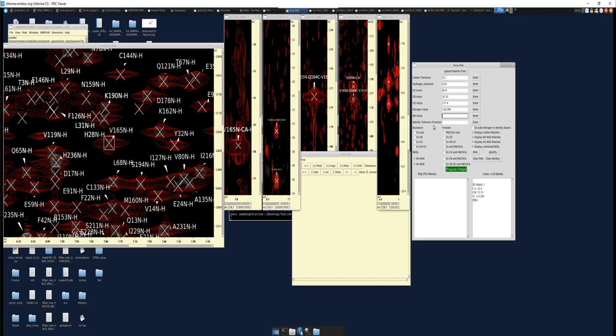So if you are not in the exact range and standard deviation that is in the BMRB deposited files, you sometimes will get erroneous matches here. So there's this option that says identify tolerance, right? And this allows you to increase the tolerance range. So if I click 1.2, this would increase that tolerance by 20%.